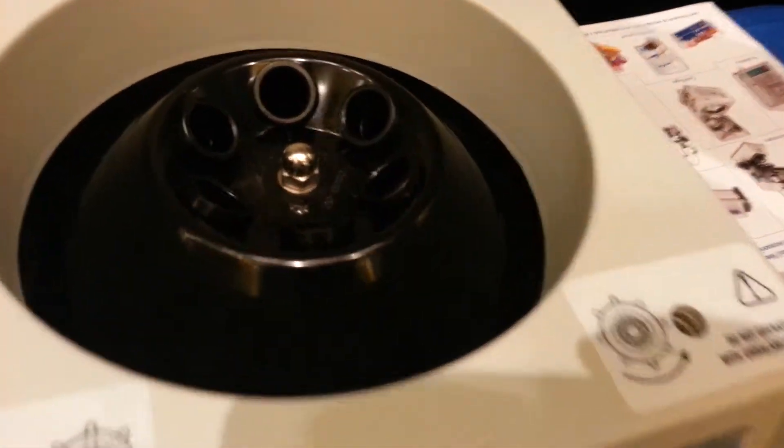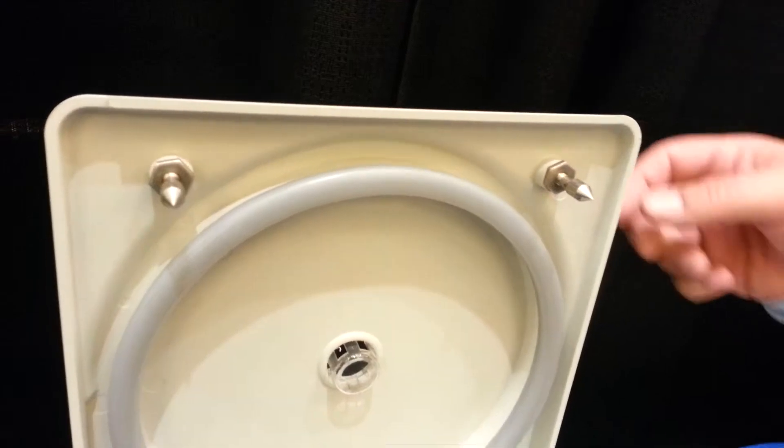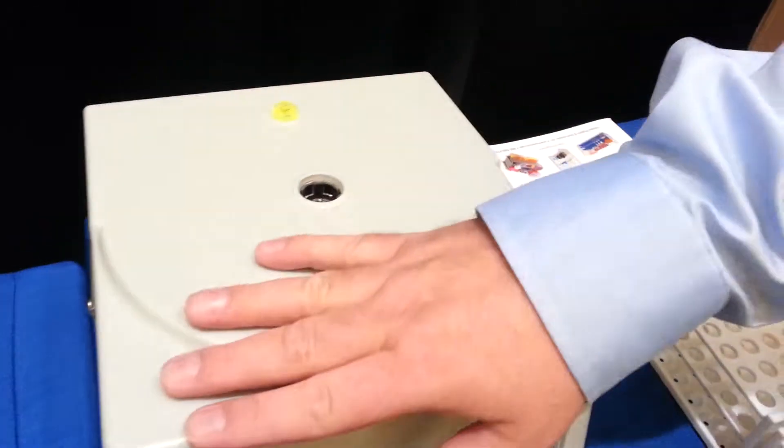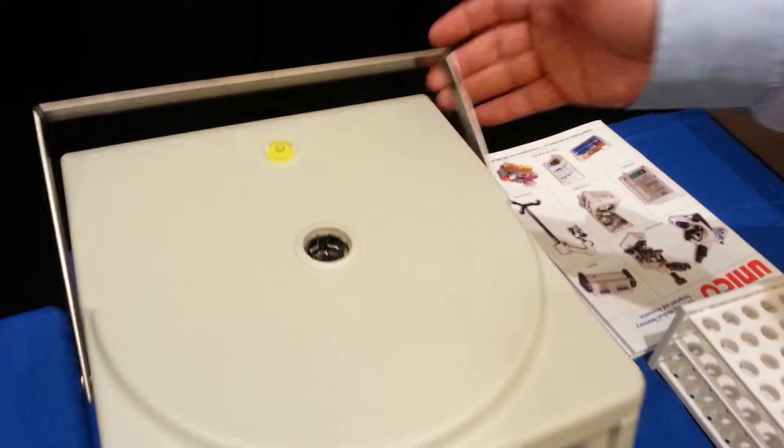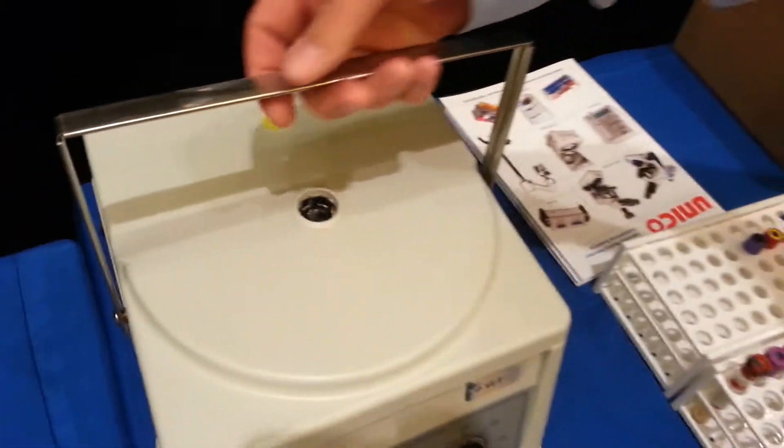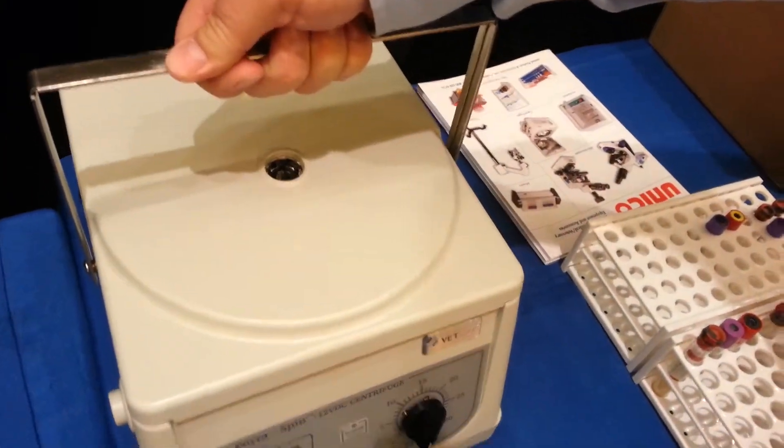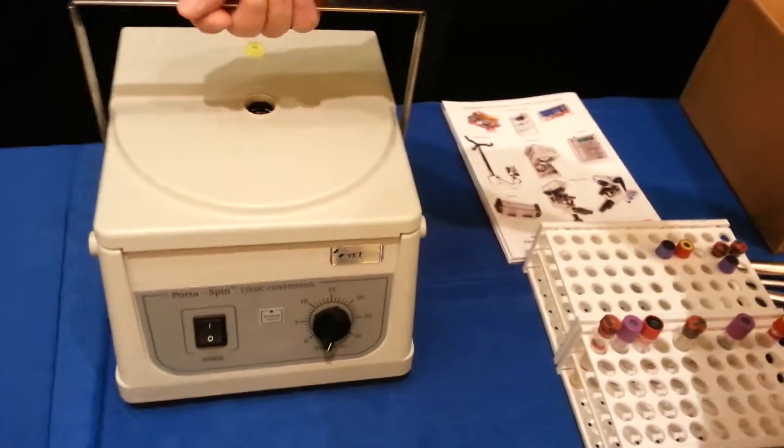If you look up here, you've got a dual lid latching system for safety. I'm going to close the lid. You can see it's got a stainless steel carrying handle, hence the name Portable Portospin.